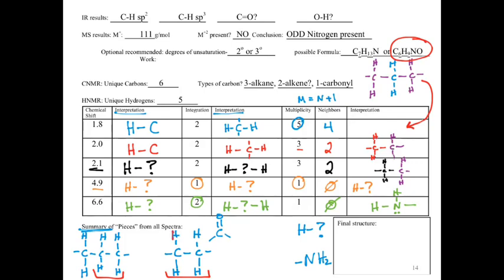I'm going to call this our red hydrogens, our red structure, and now purple hydrogen. If we took our red hydrogen over and just slid it on top, that would mean we'd have our purple CH2 out the other end, right?